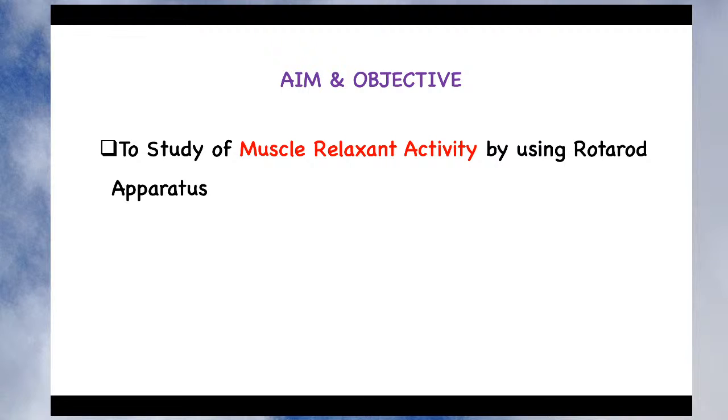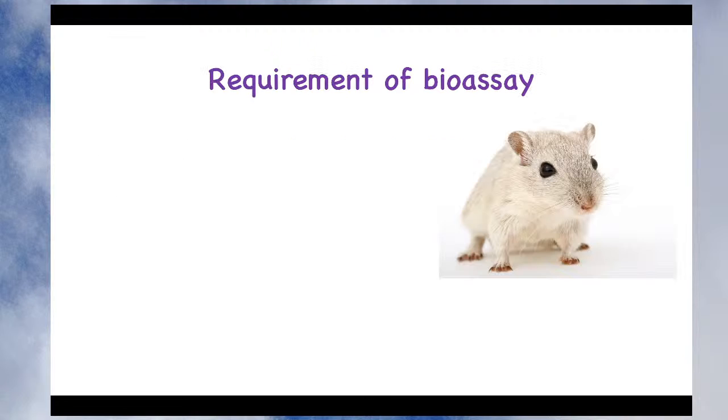So here there are two things. One is the activity that you want to study, which is muscle relaxation activity, and how are you studying it? You are studying it by using Rotarod apparatus. Let's see the requirement of the bioassay. What is needed to perform this bioassay?